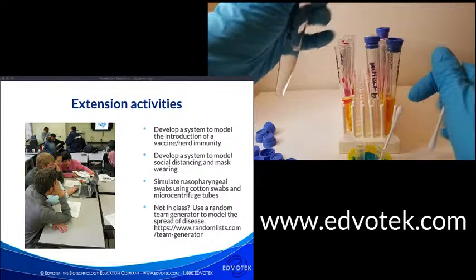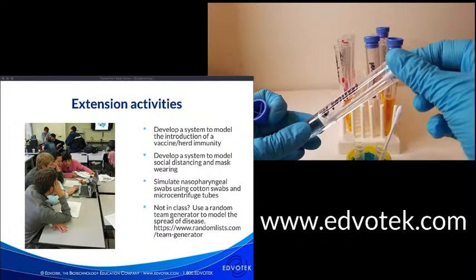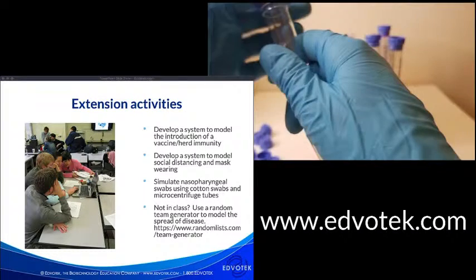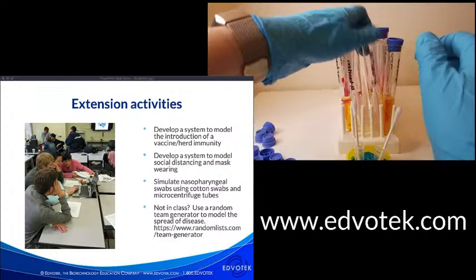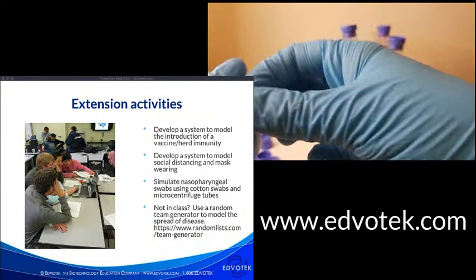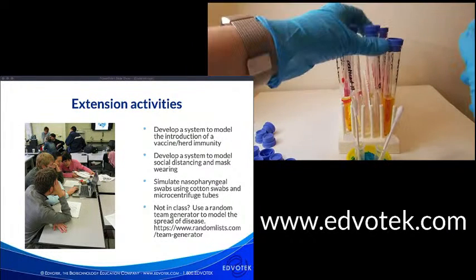And so again, we're going to use this vessel. This is going to be our model for our sinuses. So we can imagine this is a respiratory fluid, mucus, etc. We're going to take a second swab and swab patient B with our Q-tip. And then we're going to add the indicator dye here.